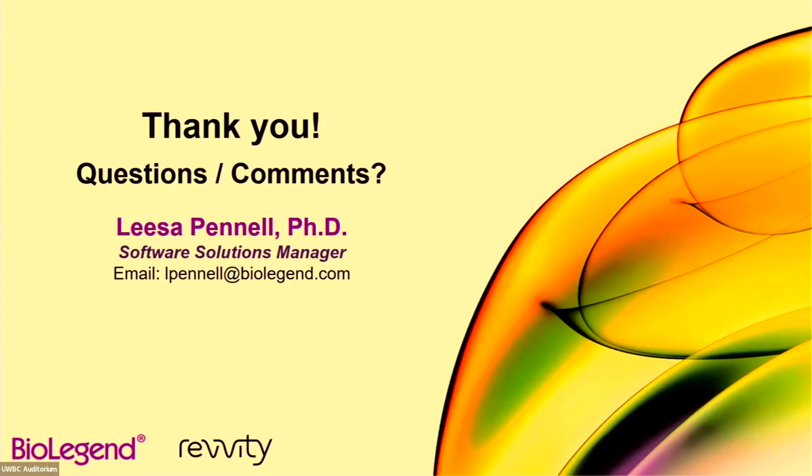they have different functions, but this is where I would encourage them to talk to us as well. The other thing is it could be possible to label with both at the same time, as long as they're titrated properly. You're most likely not going to saturate every single epitope either way, by flow or with TotalSeq. Commonly people will want to do a flow sort with a universal cocktail, and we can tell you all the clones are listed, so you know exactly what's in there. So if you're able to plan around it for flow, but sometimes you can't plan around it.